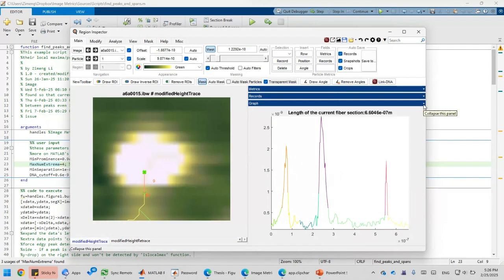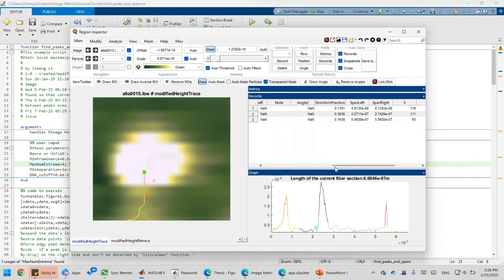Now what I can do is simply overwrite my original recordings. Let's get back my records table. So, okay, we have already recorded these 3 entries, span left, span right. Now we want a different number, because I have just moved the anchors a little bit. So I want to use my version of the span. To do that, I simply choose the start of the table, because I'm not going to write a new table. I'm just going to overwrite the original table.